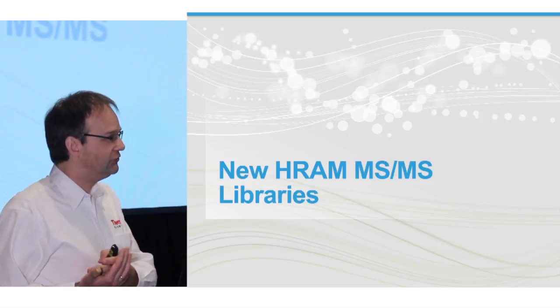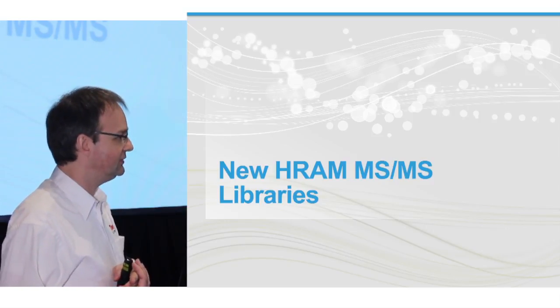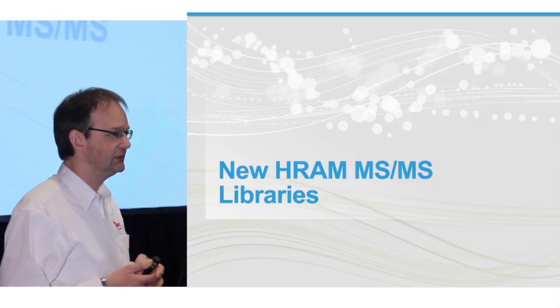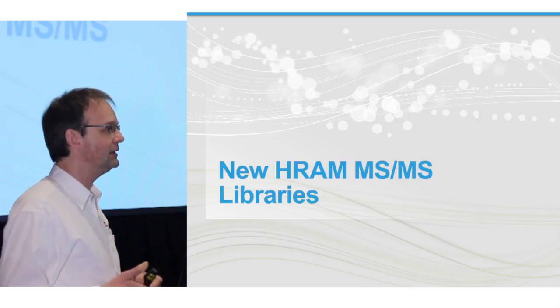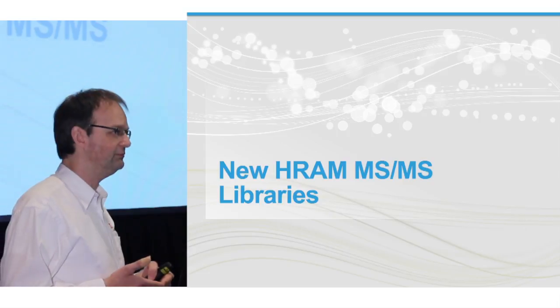So why use VDIA now if it does the same as full-scan data-dependent MS2? As I said, you can go back and look for other components, even confirm them. So the whole unknown screening with confirmation is possible here. You can go back at any time and look at any component you want to look at, which you didn't have in mind beforehand.